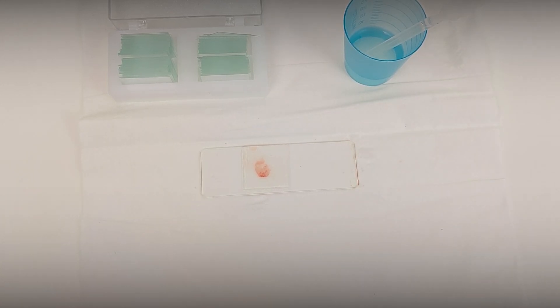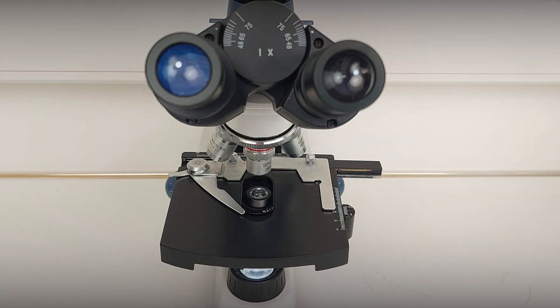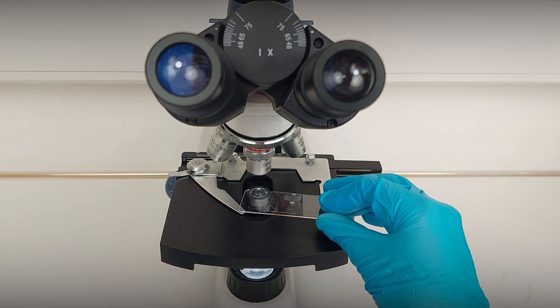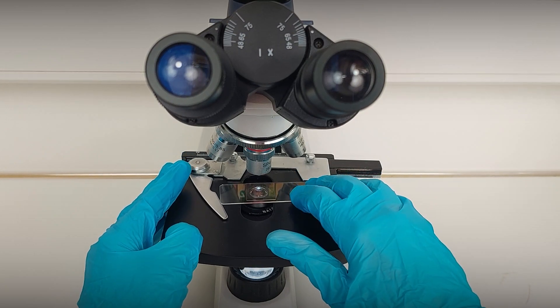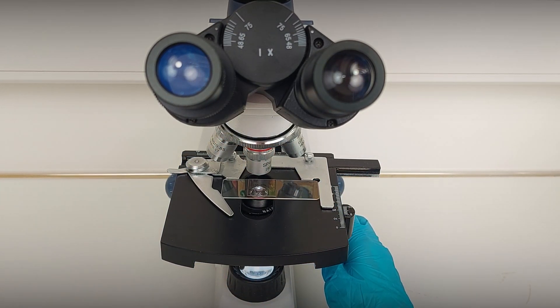The specimen is now ready for microscopic examination. It is important to examine the slides within 5 minutes after the scraping, because we are trying to find parasites that move, and some parasites will stop moving after about 5 minutes.